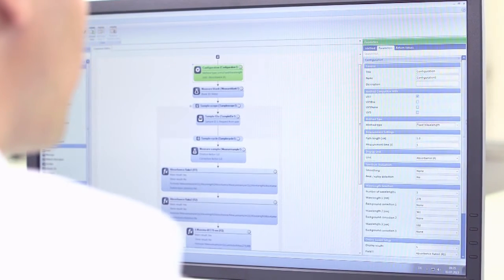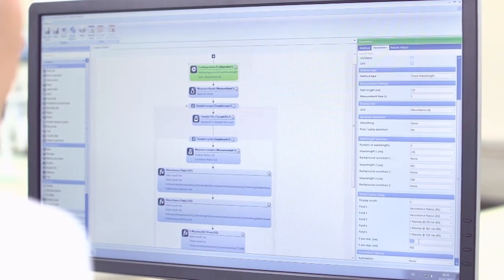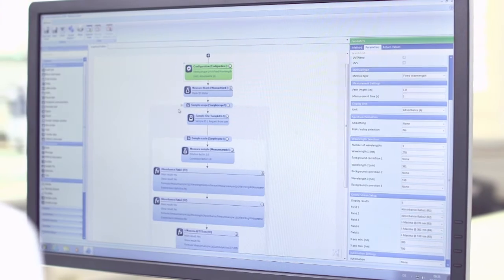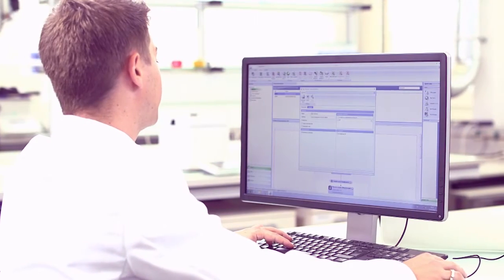LabX UVVis software streamlines UVVis workflows. The graphical method editor provides an excellent overview of the complete analytical workflow. All data and process information are centrally managed.